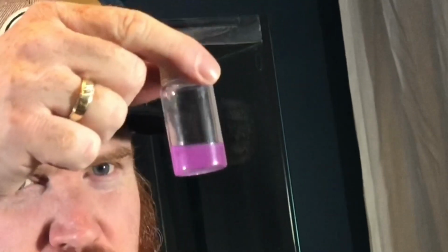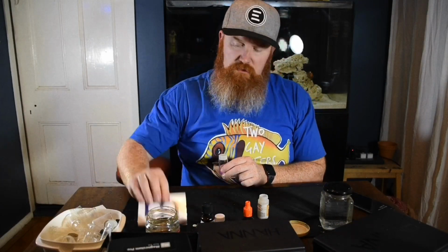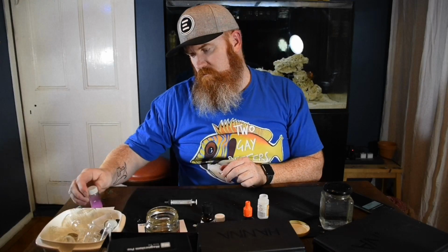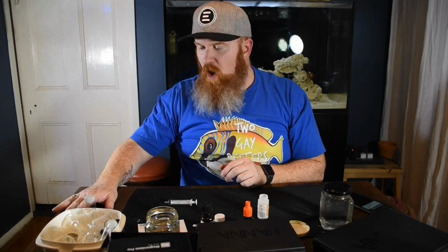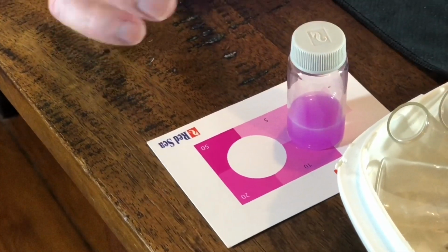Right, I can already see that it's probably sitting a little bit higher than I like, but that's okay. Hey Siri, set a timer for 9 minutes. Okay, 9 minutes and counting. Alright, so this one takes 9 minutes for everything to work. Once again, I use my iPhone for the timer.